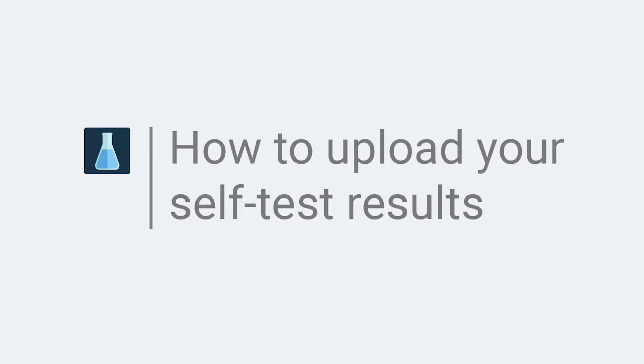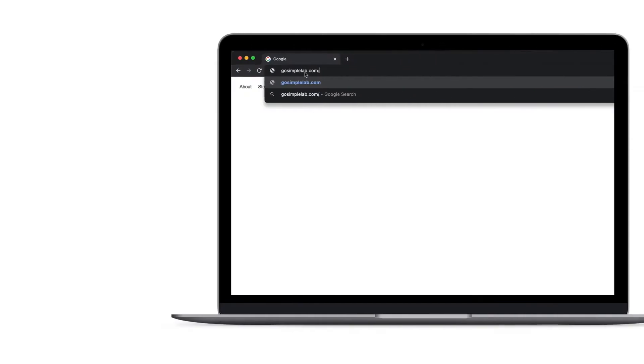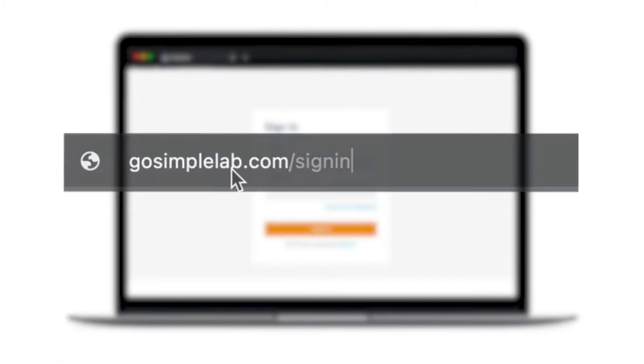Here's how to upload your self-test results to your TAP score and water report. Create your SimpleLab account if you haven't already and then sign in.